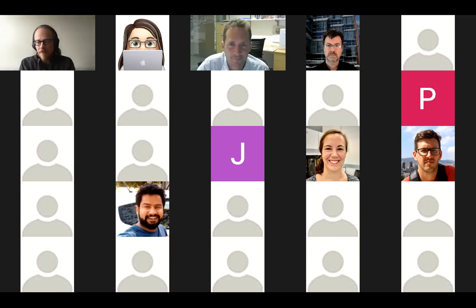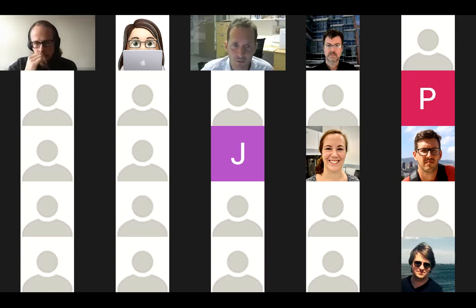From the chat earlier, William Rice asked about sub-tomogram polishing: does the frame alignment have to be done within RELION? So I think the only other software that would be partially compatible with this would be M from Dmitry Tegunov at the moment, but I'll be happily corrected.